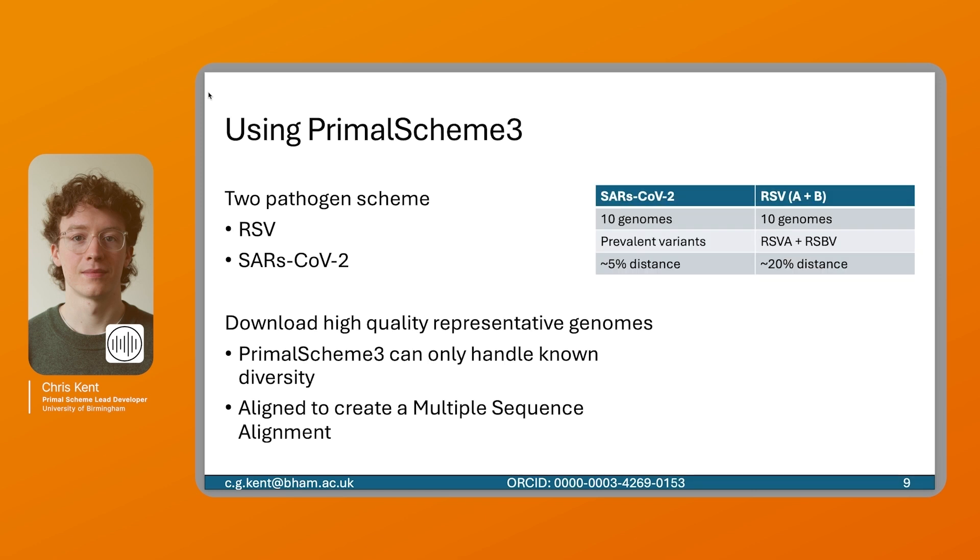For the next part of this talk we'll be using Primal Scheme 3. We'll be creating a two pathogen scheme for RSV and COVID-19. The first step of creating a scheme is to download high quality representative genomes. This is because Primal Scheme 3 can only handle known diversity in the input files, so you want to make sure that the input files you're using well represent the population you want to sequence. In this example we're using the dominant strains of SARS-CoV-2. At the moment that's JM.1, and we want to align these files to create a multiple sequence alignment.